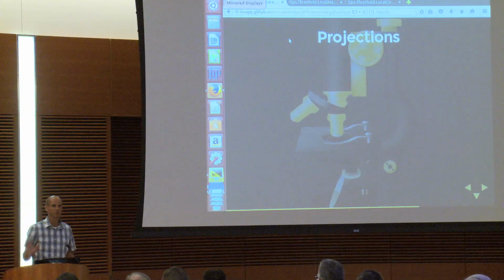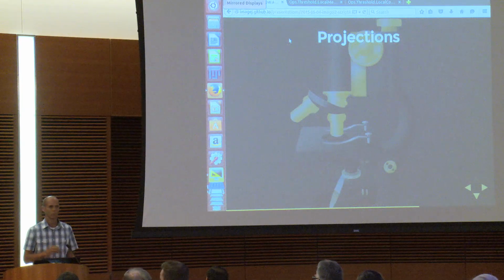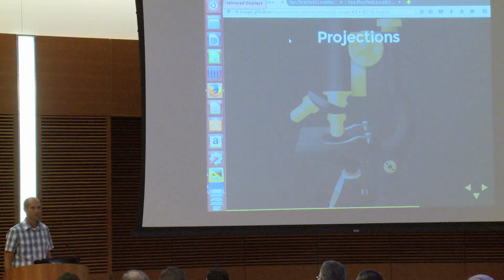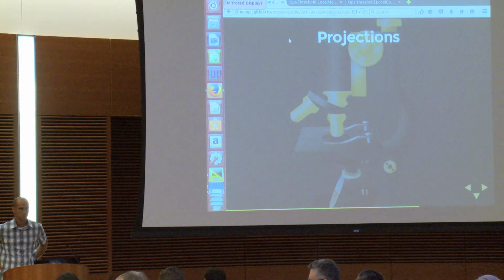Yeah, this is using the latest Fiji release. Fiji is now shipping with all this ImageJ2 functionality, so if you update to the latest release as of today, you should be able to run all this. The main caveat is that all this stuff is part of ImageJ2 core. ImageJ Ops is part of ImageJ2 core, but it comes with the Fiji distribution. So if you have Fiji, you have access to it.